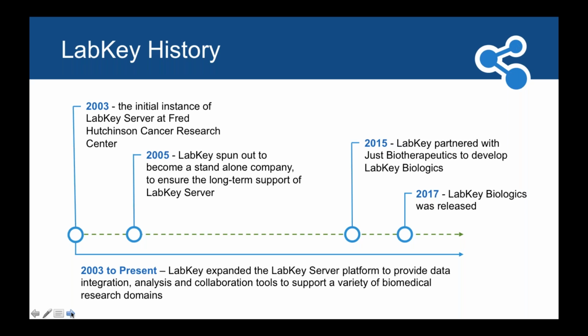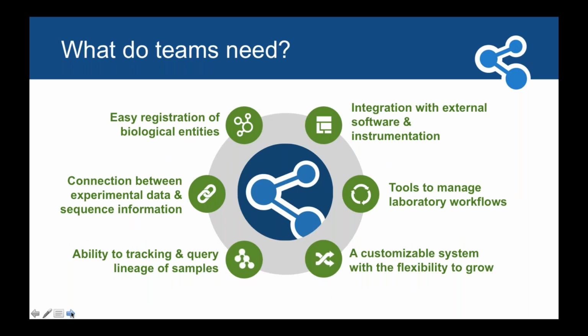Now, specifically around biologics, in 2015, we were approached by Just Biotherapeutics, which is a fairly new biotech company that is also located here in Seattle, to build a new application that leveraged LabKey Server as a foundation, but was really focused on the workflow, data management, and registration of molecular biology entities. So we launched LabKey Biologics earlier this year but continued to actively develop on that platform and that application.